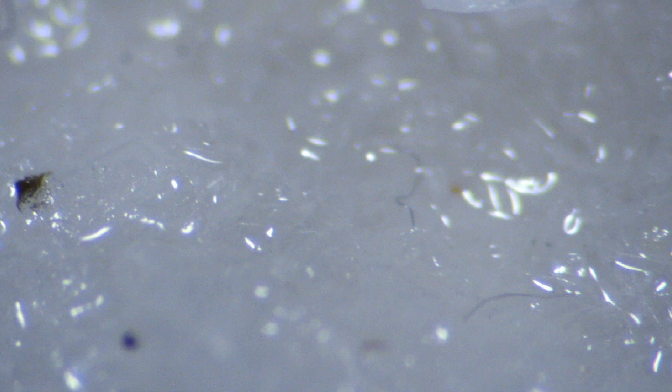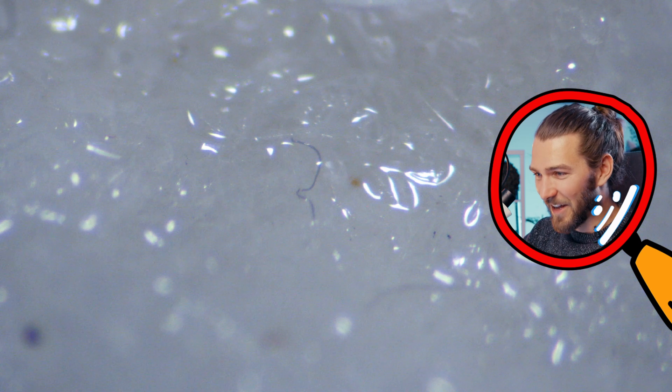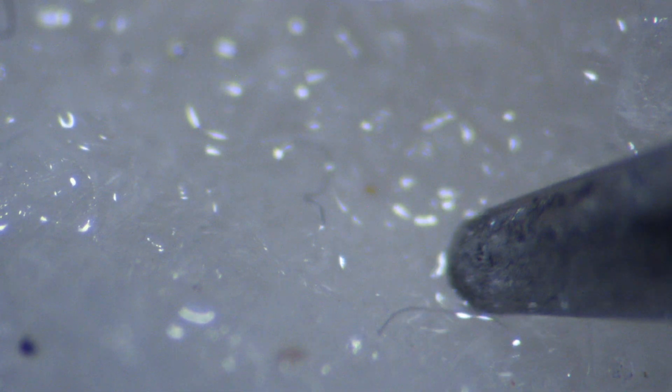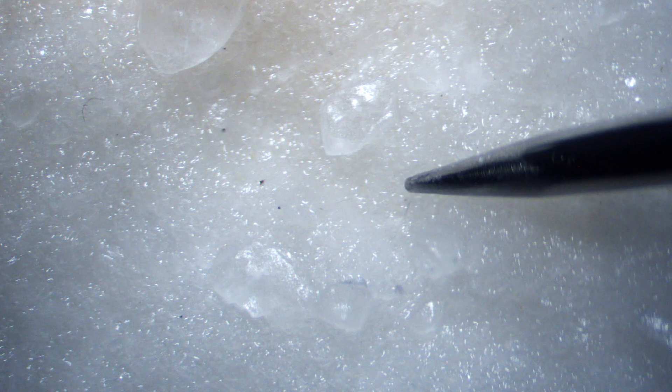If we just move a bit to the side, you can see already very small fibers. You see this one here? Right next to it also some brown and black spots — these are very small. Let me show you how big this fiber looks in comparison to my tool. You can see my tooltip here, and all the fibers are so small I can hardly see them because they're so narrow.